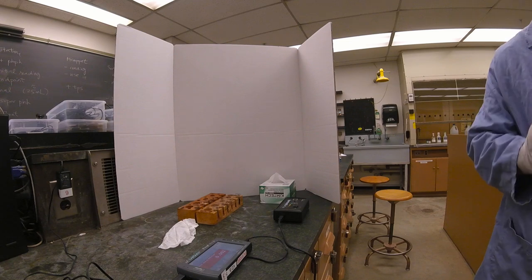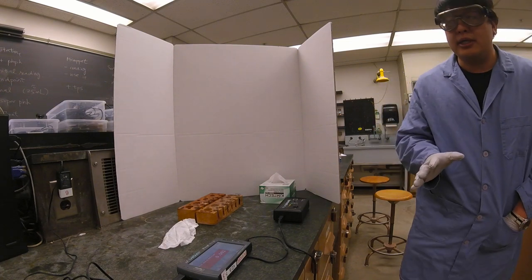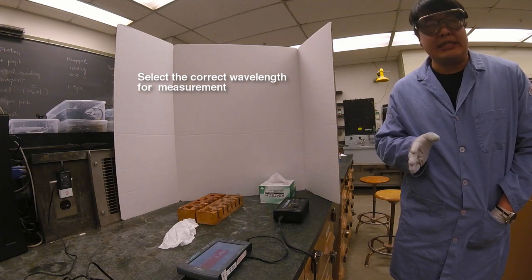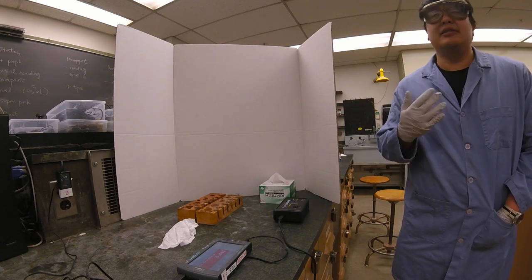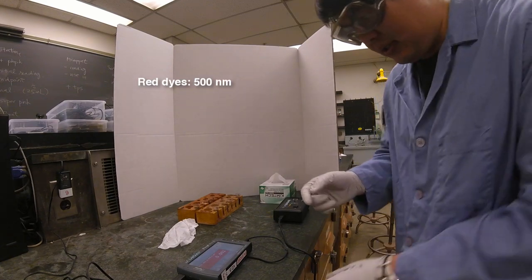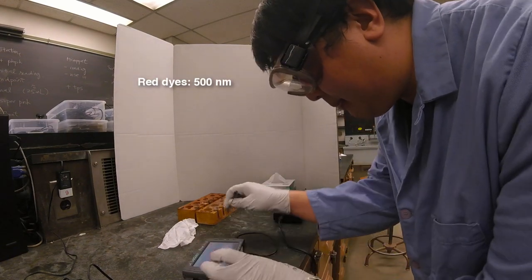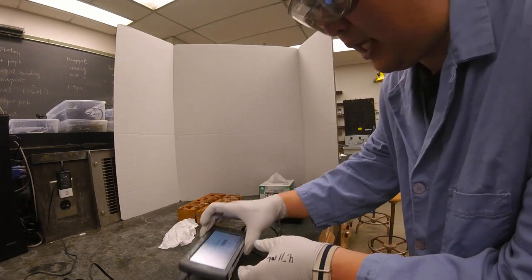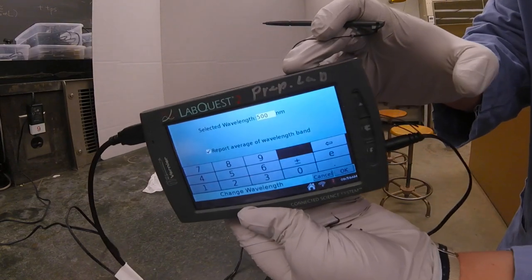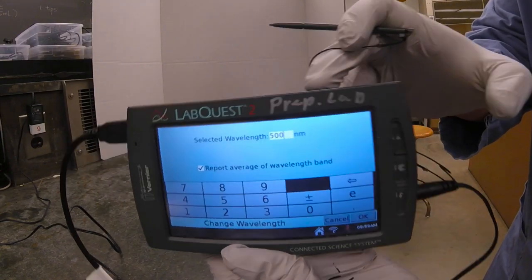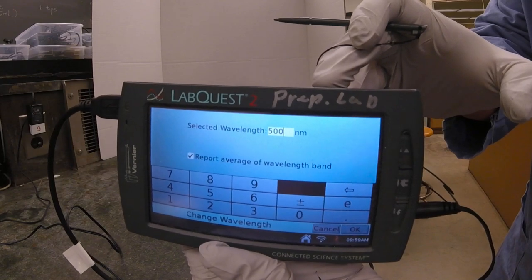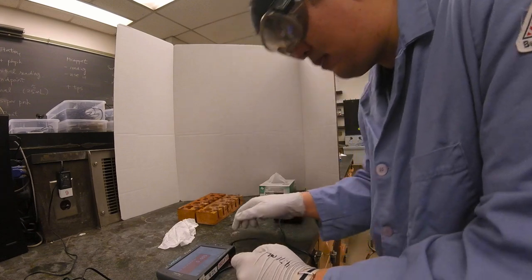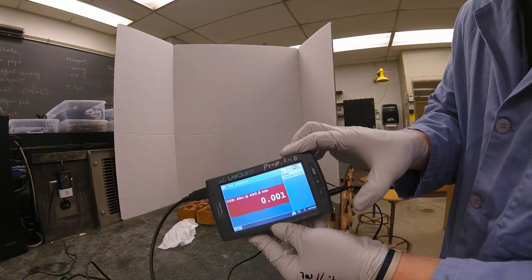The first thing that's really important is you have to select the correct wavelength for your sample. We're going to do the red sample right now, so the wavelength we want is 500 nanometers. In this window it's prompting me to select the wavelength. I'm typing in 500 and hitting okay.